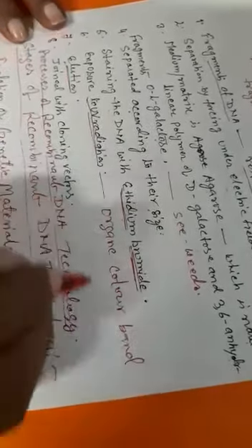The separated bands of DNA are cut out and extracted from the gel piece. This step is called elution. The purified DNA fragments are used to form recombinant DNA, which can be joined with cloning vectors.